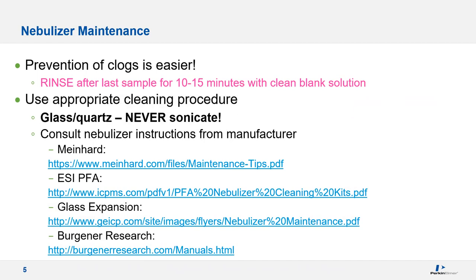The best approach is to prevent your nebulizer from getting clogged in the first place. The simple thing to do is make sure you rinse it with a clean acid blank solution after the last sample for 10 to 15 minutes. This is best done with the plasma still on, and you'll also be rinsing the spray chamber. This will prevent salts from building up in the spray chamber and depositing on your nebulizer after the instrument is shut down. You must use an appropriate cleaning procedure for your particular nebulizer — please consult the manufacturer for detailed procedures.